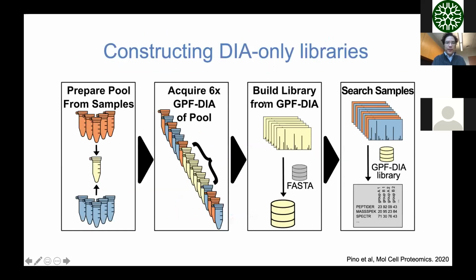Okay, so here is a figure that's presented in Lindsay Pino's paper. She actually just jumped into the chat. I saw that. Thank you, Lindsay. On constructing DIA-only libraries.